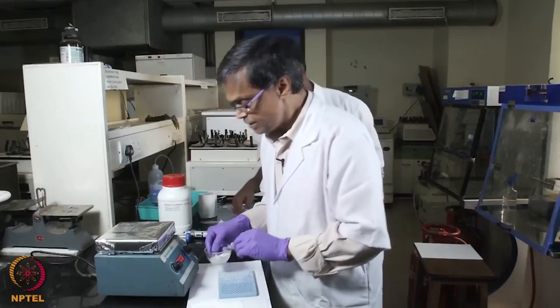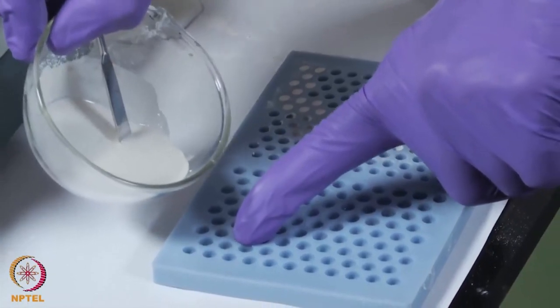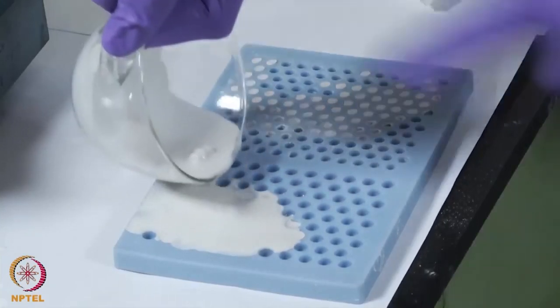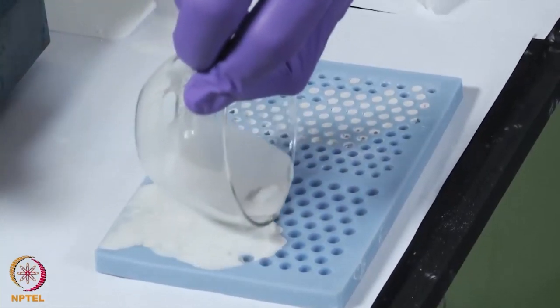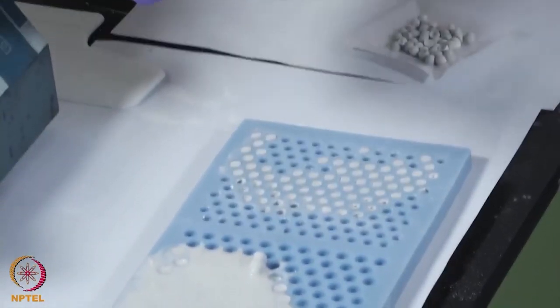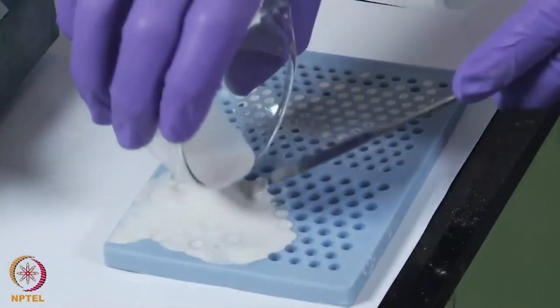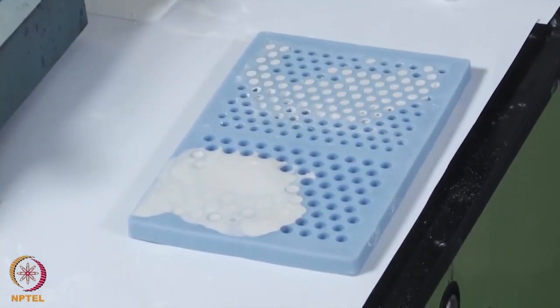Now we can pour it. As I said, we can take more quantity depending upon how many beads you want to make. Here I am going to show you a very small region — we just have to pour it on top of this mold and then use the applicator. We need to tap it a little bit so that the liquid flows nicely inside. As you can see here it is filling up the holes and we need to tap it.